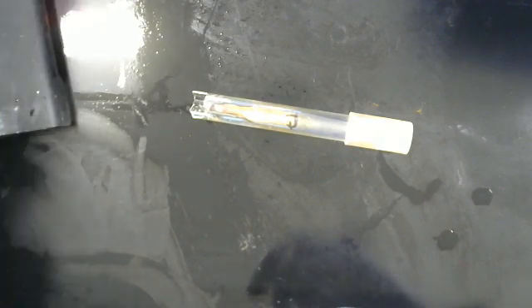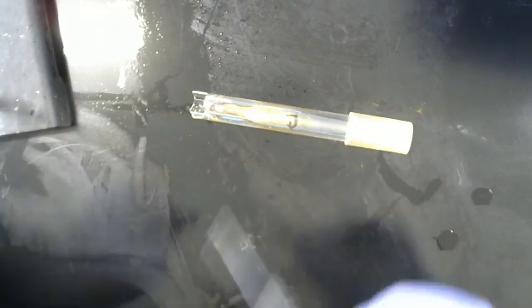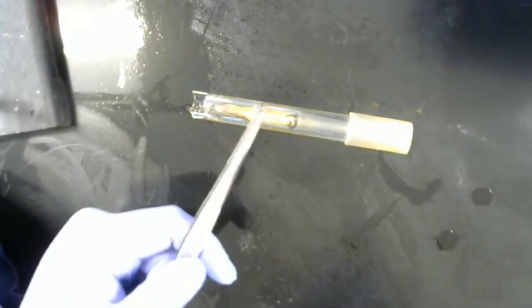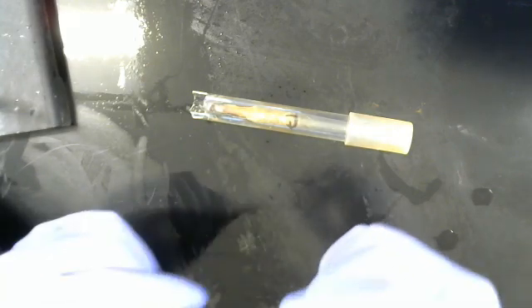We do have a formal sharps bin for things like razor blades — it's also under the biological safety cabinet and the back of each room. And we also have a box of non-biohazardous sharps and non-biohazardous broken glass in the autoclave room.